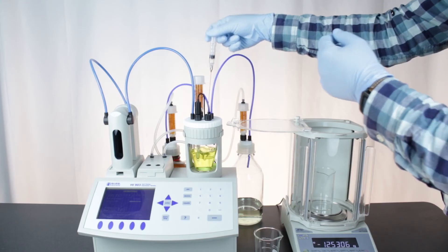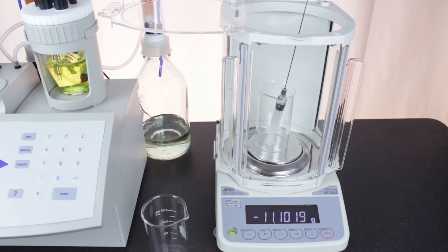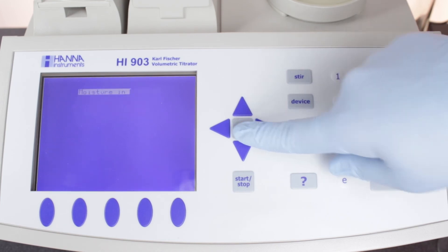Remove the syringe and re-weigh it. The negative weight that appears is the number you enter on the titrator. After you enter the weight, press enter to begin the titration.